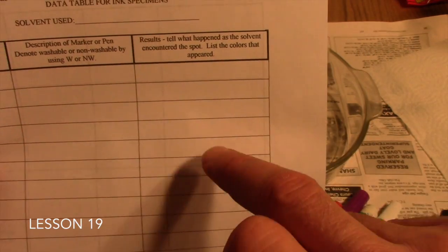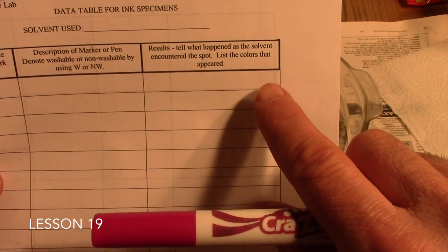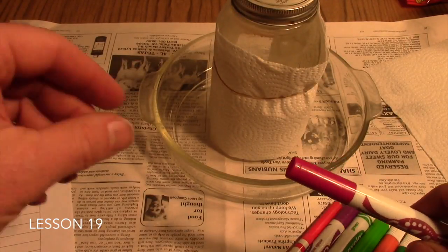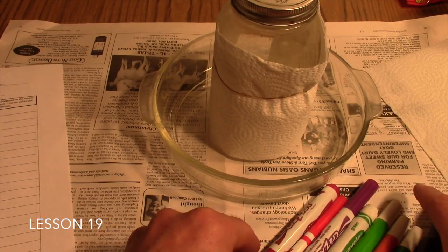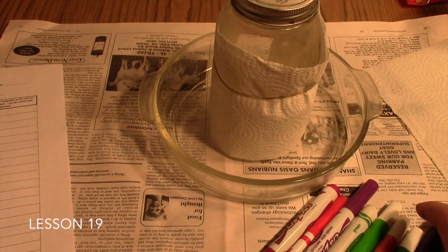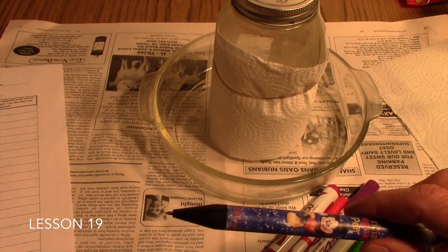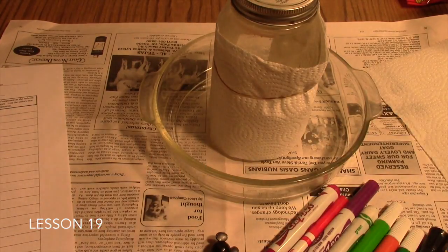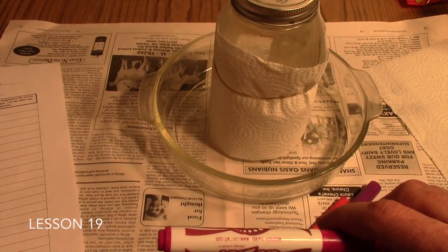The third column is then where you'll write your results of what happens after we apply the solvent to the ink. Now, with your marker, we suggest that you do choose both washable, non-washable, permanent markers, and then even pens of many different kinds to test the solvent's ability to separate the inks that make up those various colors. So, we've got our first color designated here.